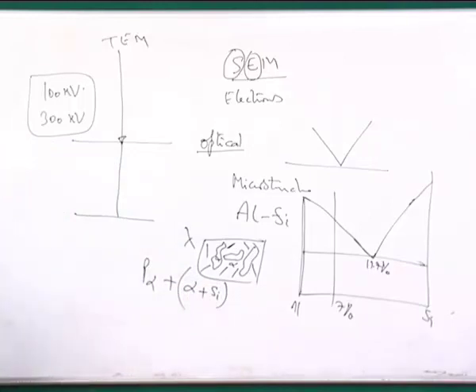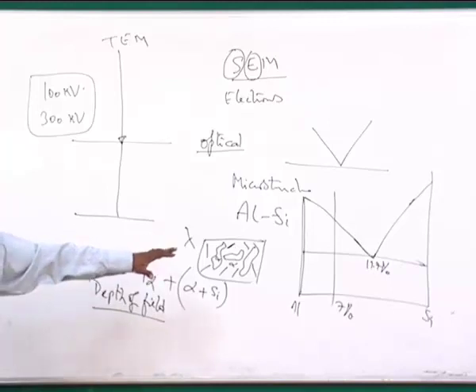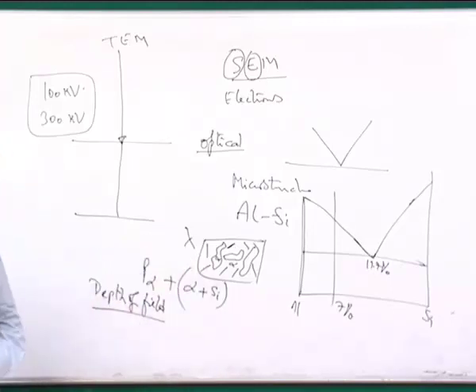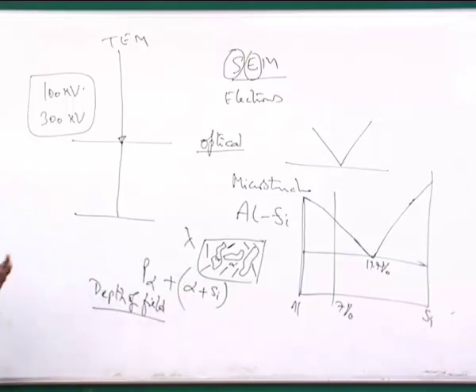This microstructure you should be able to even see in an optical microscope, but one advantage that you can achieve in this scanning electron microscope is, because it has an excellent depth of field, you will be able to see the three-dimensional information about these particular needles. Are they really needles? Are they plates? That is information that you can see by deep etching the surface. If you deep etch the surface and then look at it, because it can show you the depth information, you will be able to see the actual morphology of silicon particles, for example.